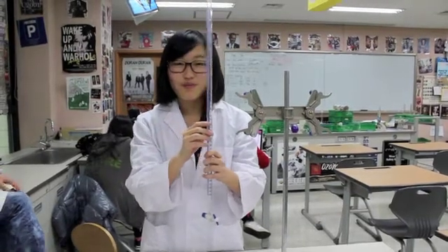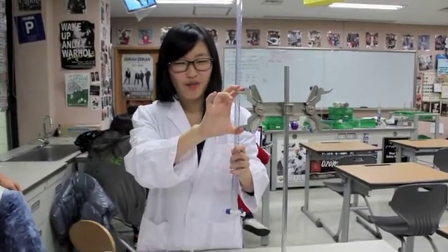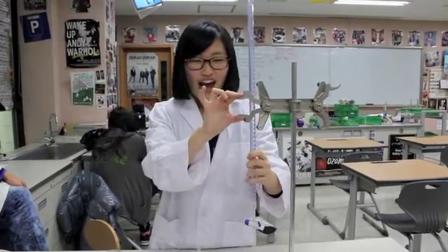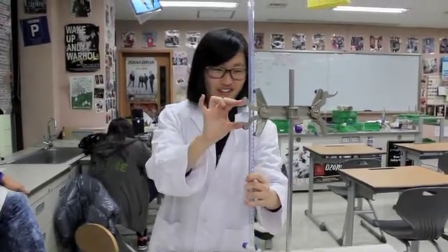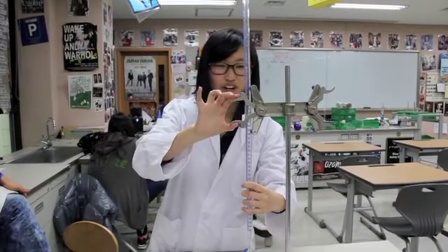The burette should be secured to the burette clamp. You put your thumb and your pointer finger to control the clamp. Press to open, and release to close. Place the burette in the upright, vertical position, accurately parallel to the ringstand. This step is crucial to take an accurate reading of the meniscus.